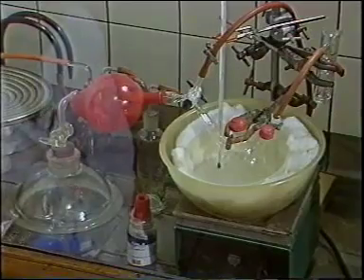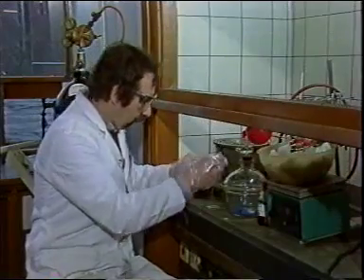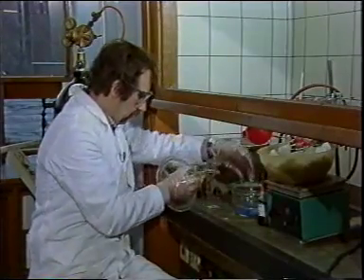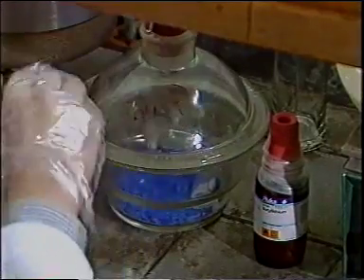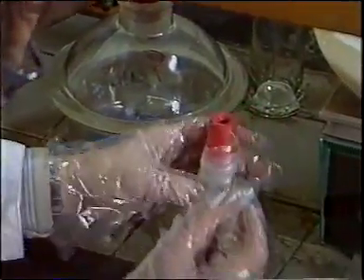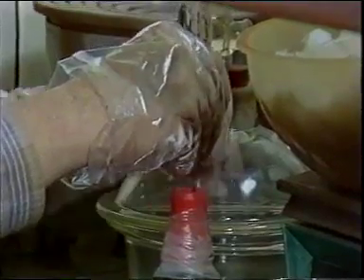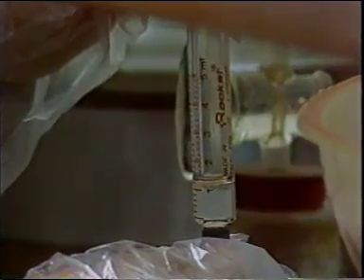I shall add the butyl lithium in hexane solution through a syringe. I know I need about 5 centimeters cubed.